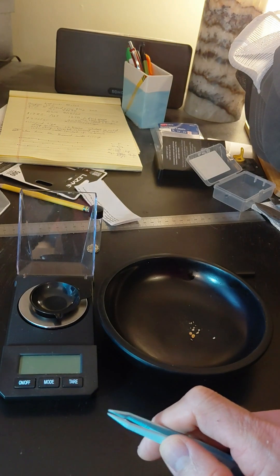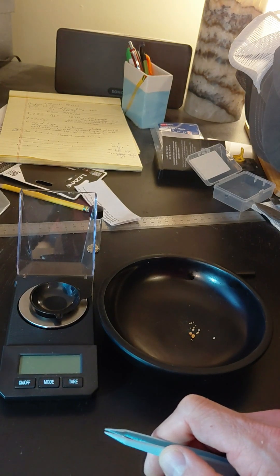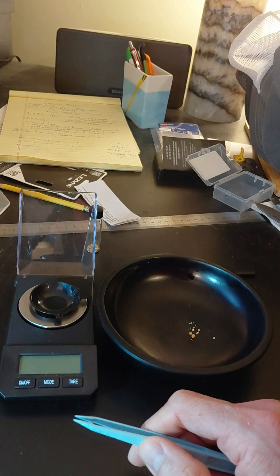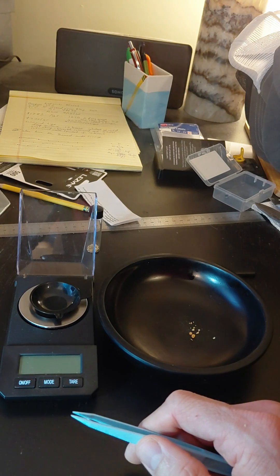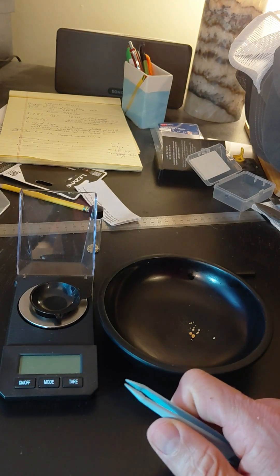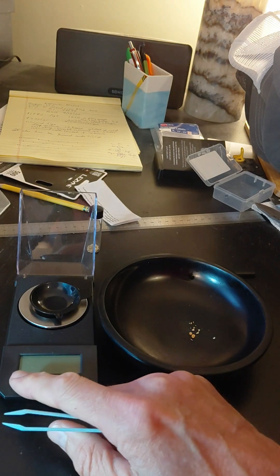I'm sure a lot of gold prospectors have these cheap Amazon scales. I don't even know if this has a brand on it. I think I paid 10 bucks for it or something. It supposedly has a one milligram accuracy, so let's put that to the test.